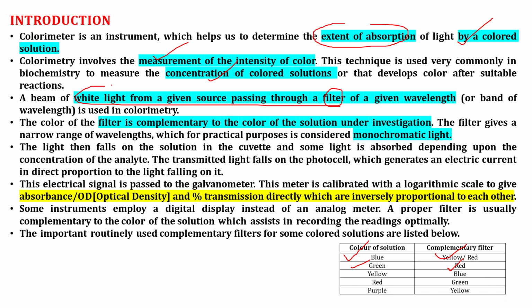So when light falls on the solution in the cuvette, some light is absorbed depending on the concentration of the analyte, and the rest falls on the photocell, which generates an electric current and will give the optical density and absorbance. Okay, so this is how it works.